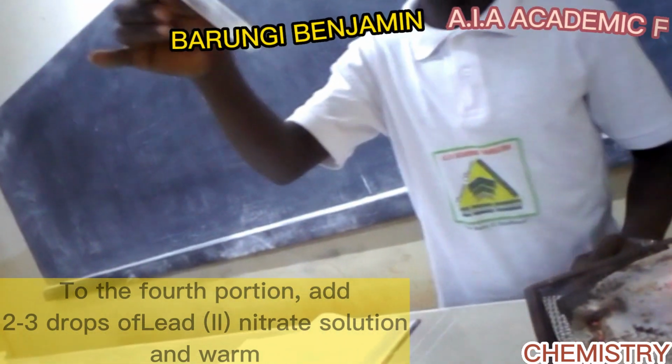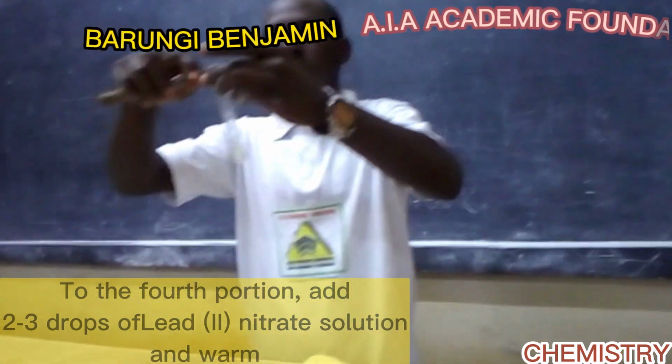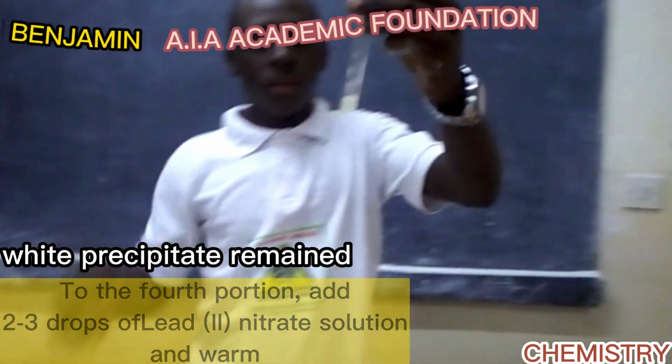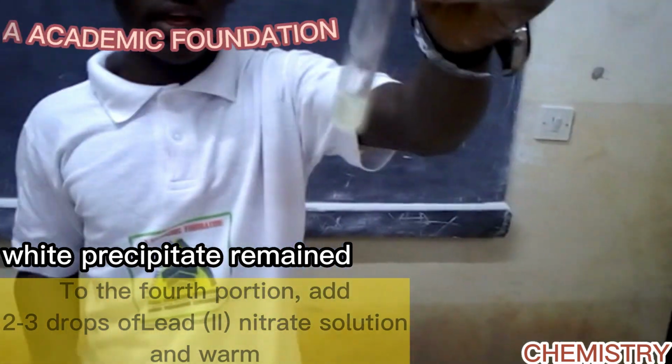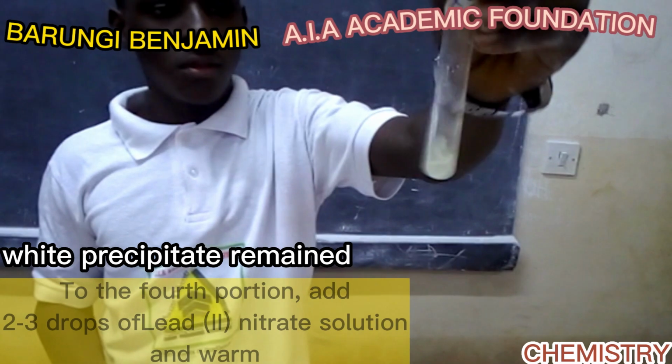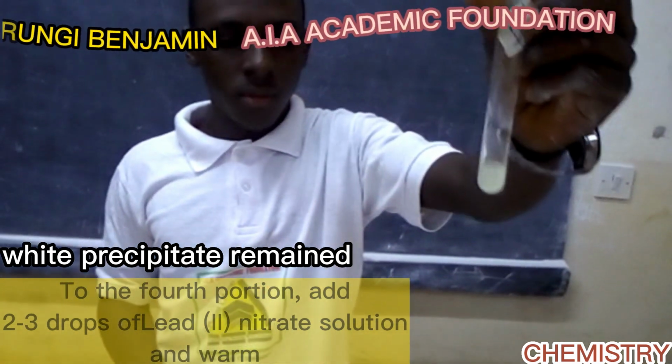After warming, we are seeing that the white precipitate has not dissolved. It is still there. The solution is still white with the white precipitate.